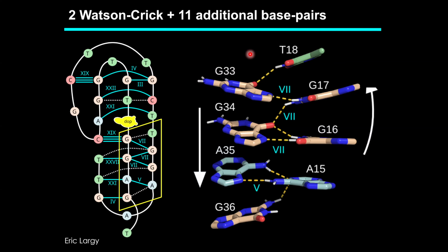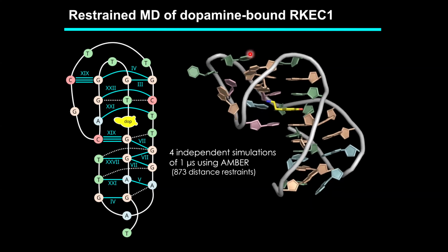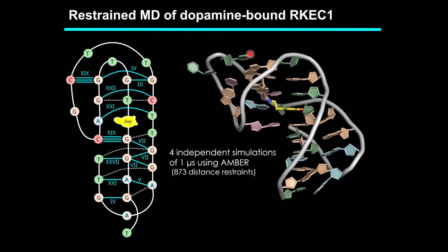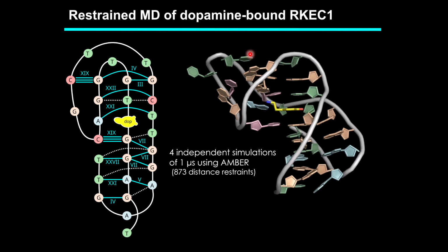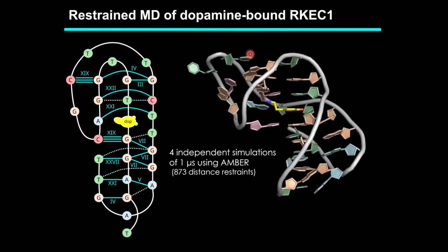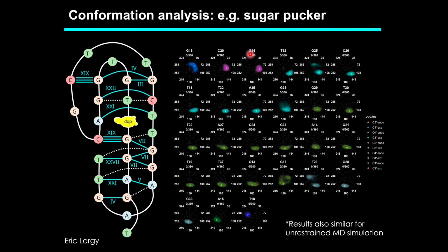So I think already this is, at least to me, an important lesson that because there's selection, you can really access quite unusual structures of DNA. And hopefully you see that already from this example. When we did the structure, I showed you the structure derived from the NMR data. Very often we also see what it would look like if you remove the restraints, the different distances that we put into the structure. So this here shows molecular dynamics of a microsecond with and without the NMR derived restraints. And we tend to look at them in many different aspects.